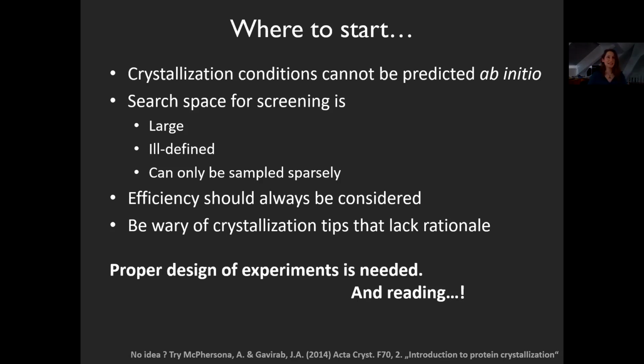We cannot look at your sequence and tell you, well, please use 20% PEG and tris buffer at pH so-and-so, it will crystallize. This is not possible. The whole thing is more like alchemy. Not only do you use cat whiskers, there are a number of other rather obscure ingredients which we are using in just the hope or praying to our deity that the stuff will crystallize.